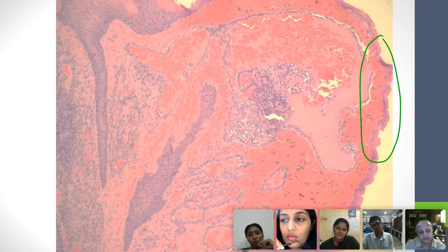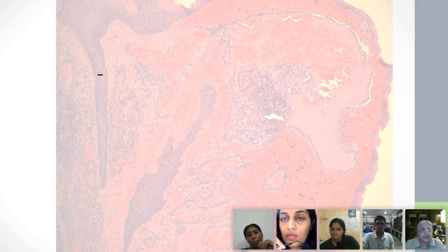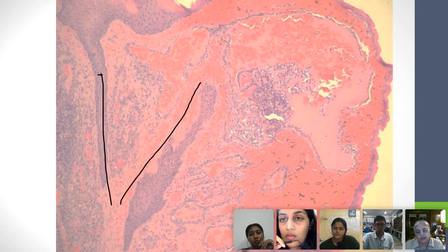So on the left-hand side, we can see the keratinized squamous mucosa with the tongue going. And the one which she has marked, it's the normal mucosal lining. I see. So, a normal mucosal lining, according to you, Kshitija, is what kind of mucosa on the inside of the lip? According to you, this is skin, right? All of this. Yes, ma'am. And according to you, this is the mucosa.